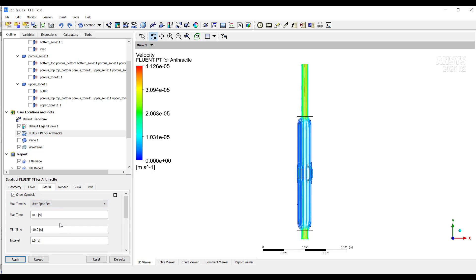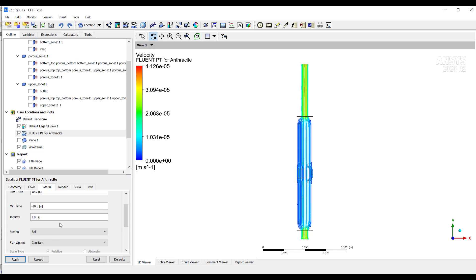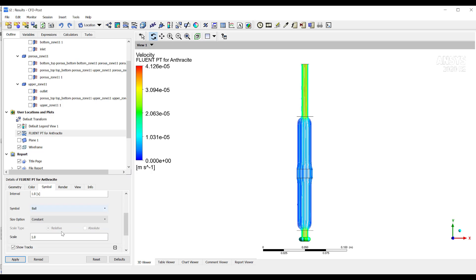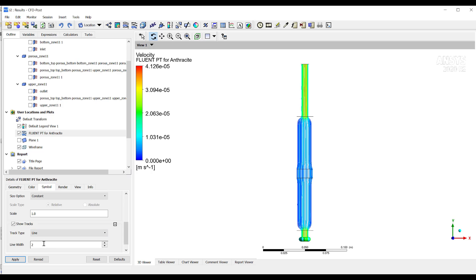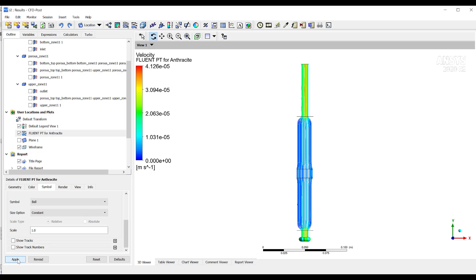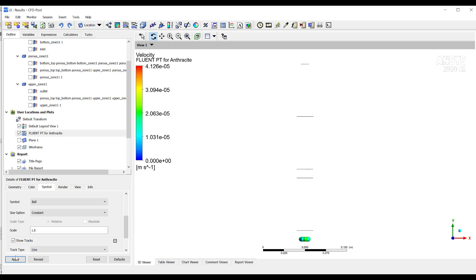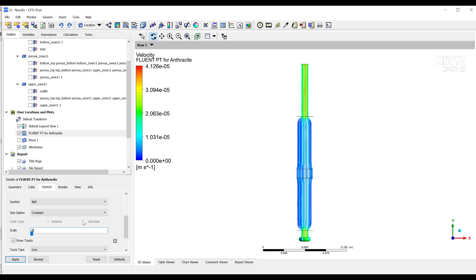You can, for example, disable to not show tracks. If you want to show tracks, then you can here put the ball smaller. And for example, if you want, maybe you can do an animation.